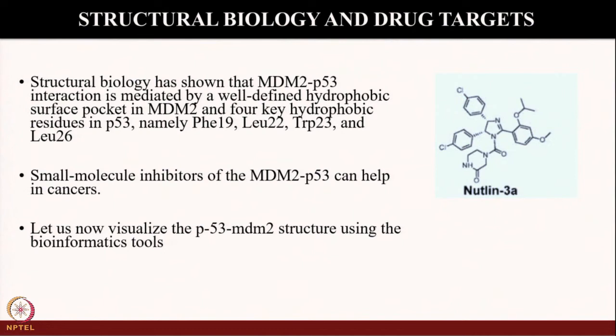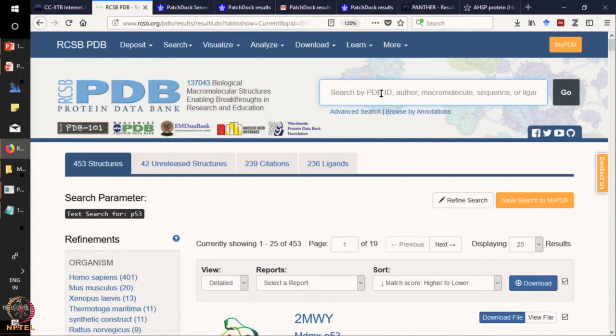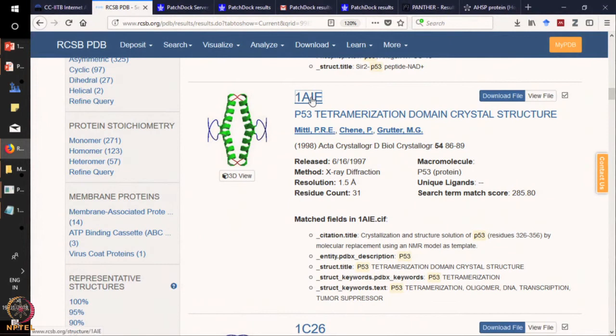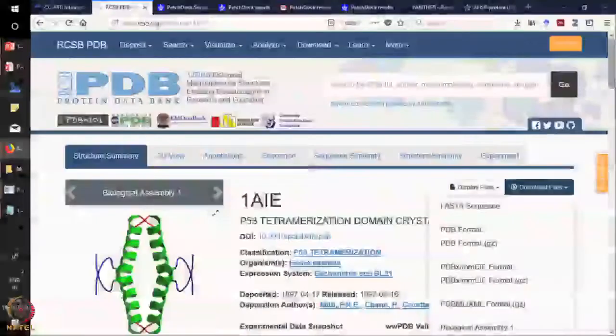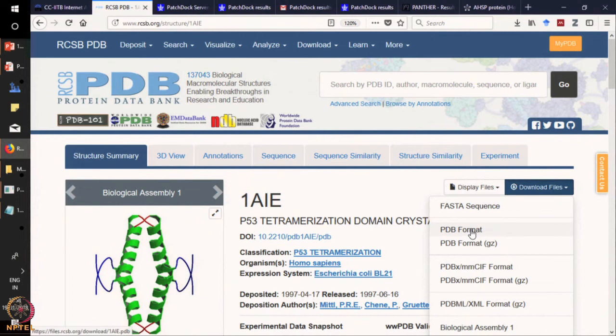Now let us visualize P53 and MDM2 structure using bioinformatic tools. Going to the home page of PDB and typing P53, you can find various structures of P53. If you click on a P53 structure, you will get the option to download these molecules in PDB format. As mentioned earlier in the lecture, PDB format can be used in PyMOL and we can do the molecular docking.